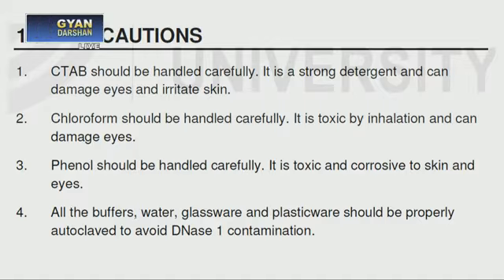Now, what precautions do you need to take for these experiments? CTAB should be handled carefully, because it is a strong detergent that can damage the eyes and irritate your skin. Chloroform and phenol should both be handled very carefully. Chloroform is toxic by inhalation and can damage the eyes. Phenol is toxic and corrosive to the skin and eyes.